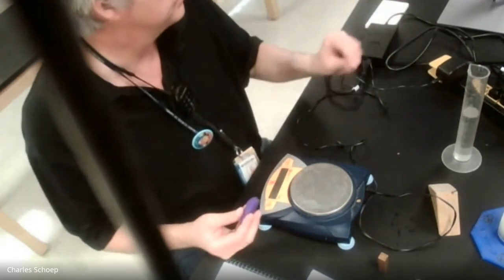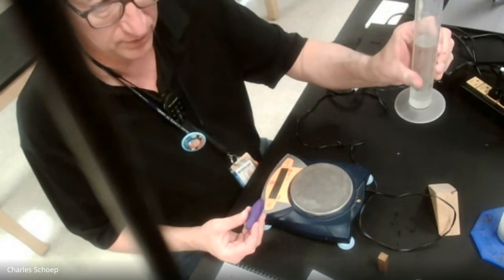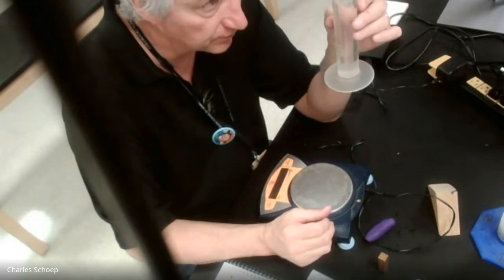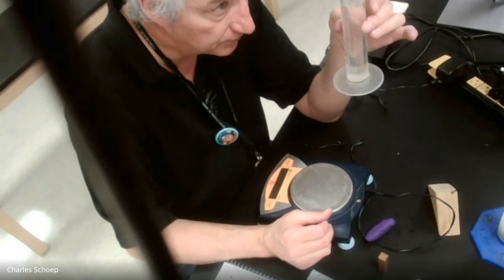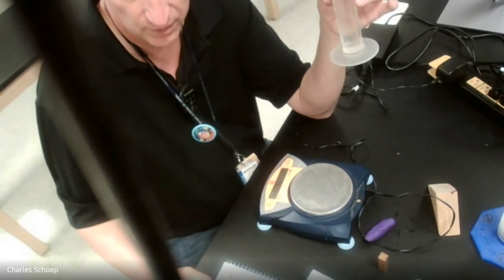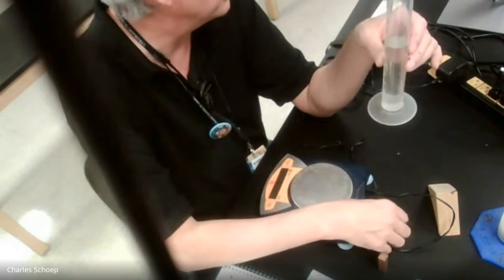So what I can do with my modeling clay is, I grabbed the smaller graduated cylinder so I could get a more accurate measurement. And my initial volume here is 71.5 milliliters.